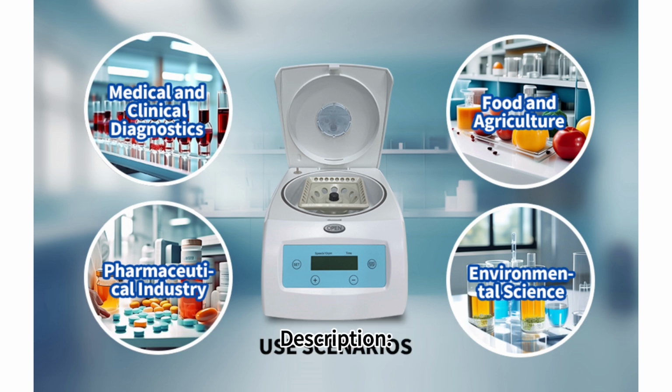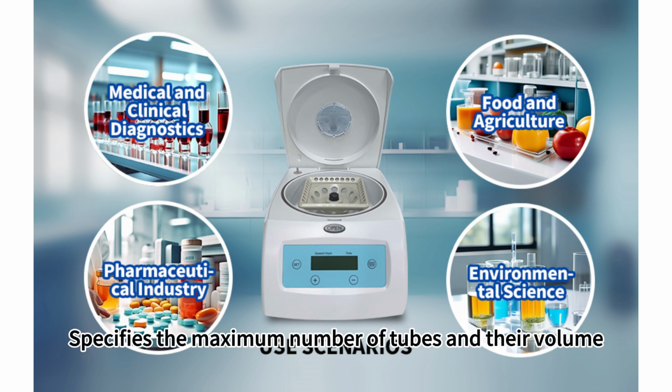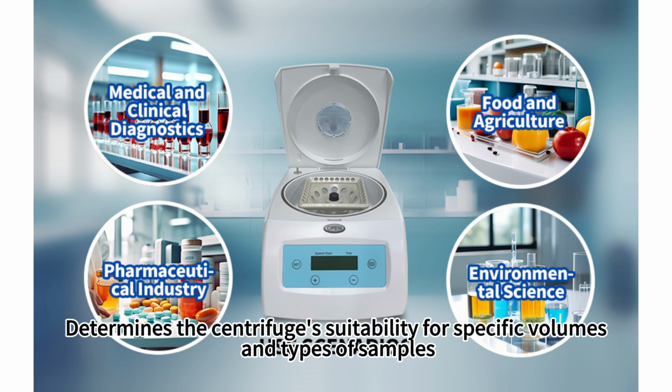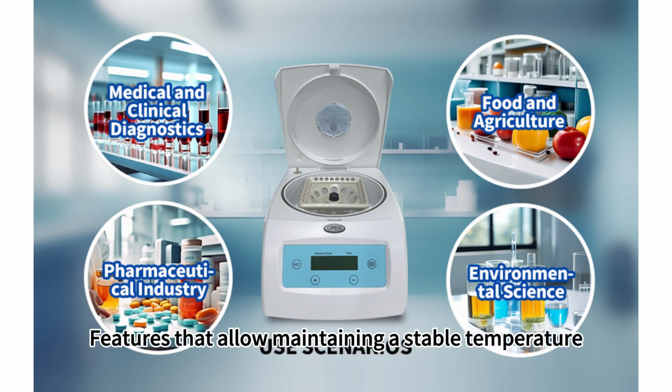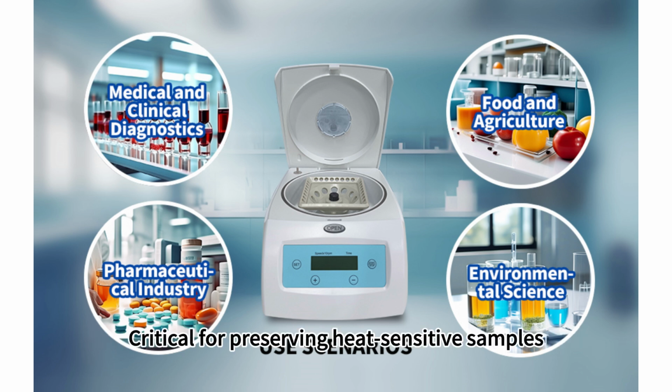Capacity limits. Description: specifies the maximum number of tubes and their volume. Importance: determines the centrifuge's suitability for specific volumes and types of samples. Temperature control. Description: features that allow maintaining a stable temperature. Importance: critical for preserving heat-sensitive samples.